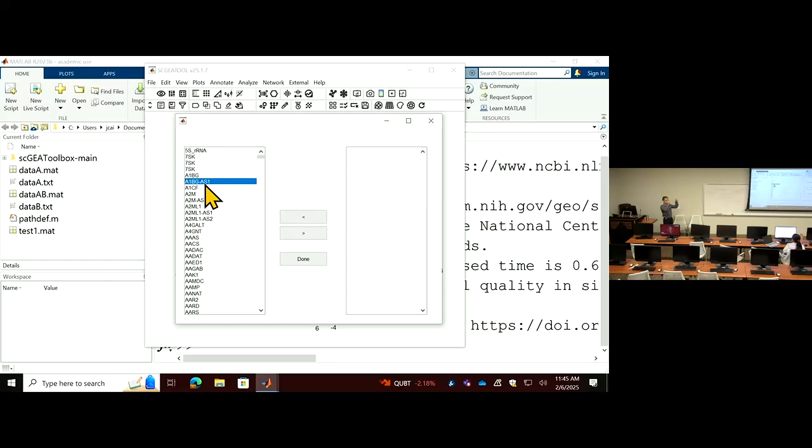If you focus on that research, you may say, okay, this is important because it creates antisense transcripts, maybe targeted to the parent genes and inhibiting their expression somehow. But if you have no idea what they are, you can remove this from analysis. So this is one case, and there are quite a lot if you don't remove those antisense transcripts.